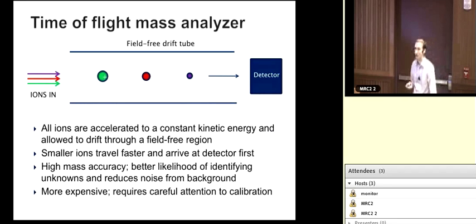Detergents are generally the enemy of mass spec. You might use Triton all the time in one of your cell extraction protocols for your biochemical assays, but mass spec loves detergent. It loves to ionize detergent, and it loves it so much that it will prevent ionization of your other molecules of interest.